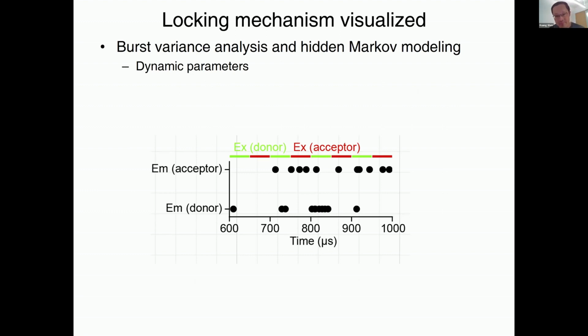So here is the raw data of the photon stream. If we calculate the FRET efficiency here, we can get 1 spot in the ES plot, as we have seen before. But that is an under-usage of this photon stream data. So what people have come up with, a genius idea to make more use of this data, is, instead of calculating the FRET value from all the photons here, they create a window, for example, 7 photons, and they calculate the FRET value of this subpopulation of photons.